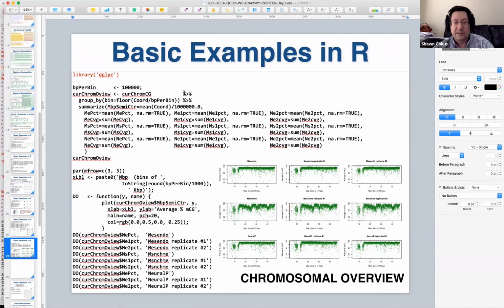And this is really just an operator that's got a horribly funny name. One of the things about R is that pretty much anything that looks like line noise, you bang random symbols together, it's a valid R symbol name. And so you can associate code with those and make them operators and so on. It's kind of cool. So this is really a function inside dplyr. They're just doing this to make the syntax nicer, some syntactic sugar, really.